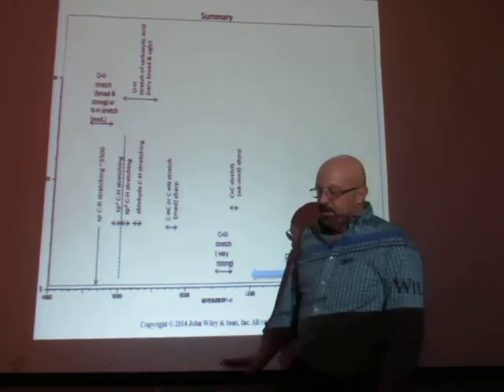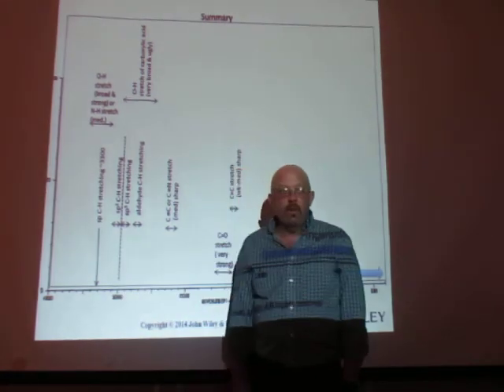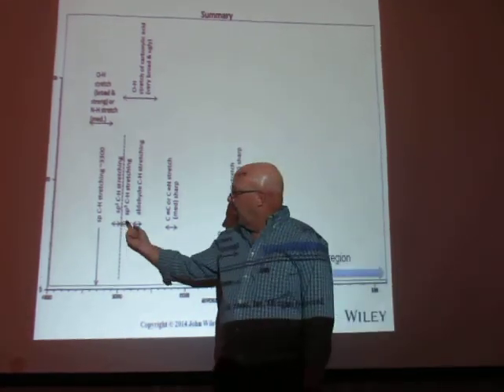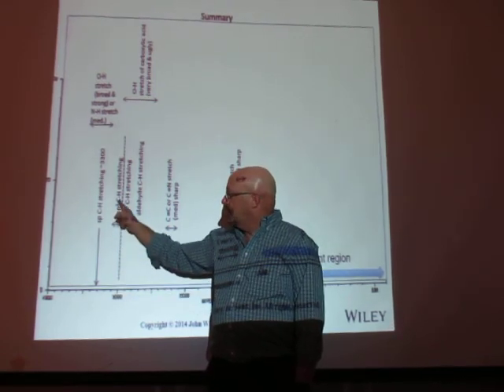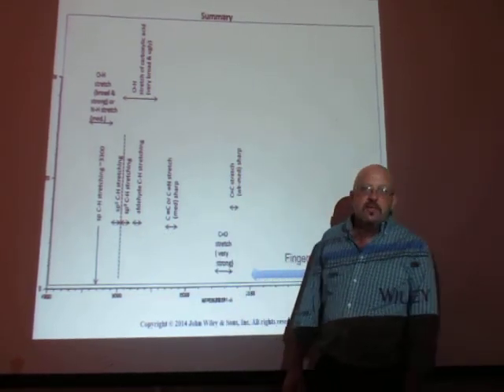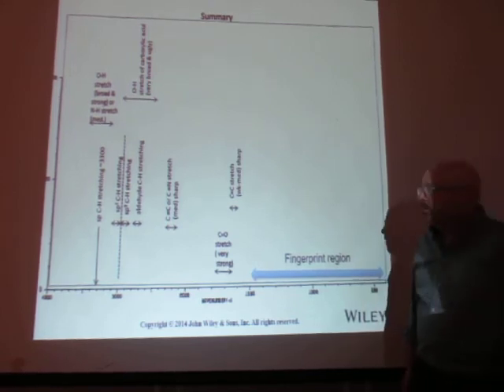As I've mentioned many times today, I love the 3000. I go there first. Slightly below 3000 is SP3 CH stretching. Slightly above 3000 is SP2 CH stretching. Those are easy to pick out, and that gives you a lot of information about your molecule.